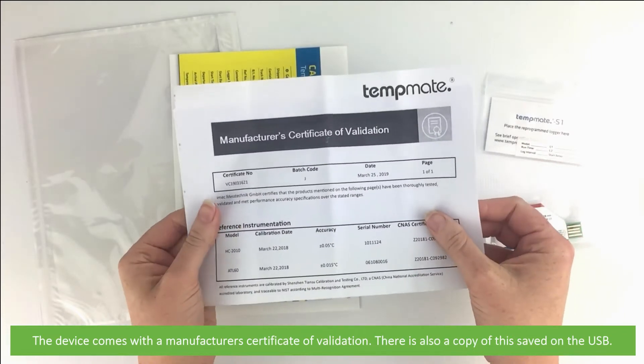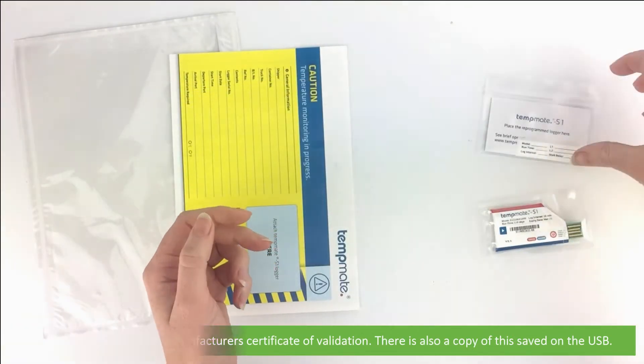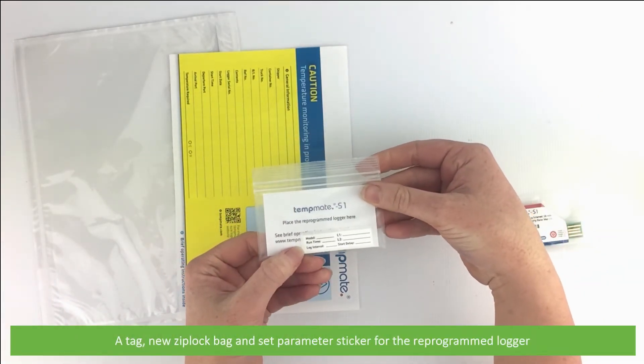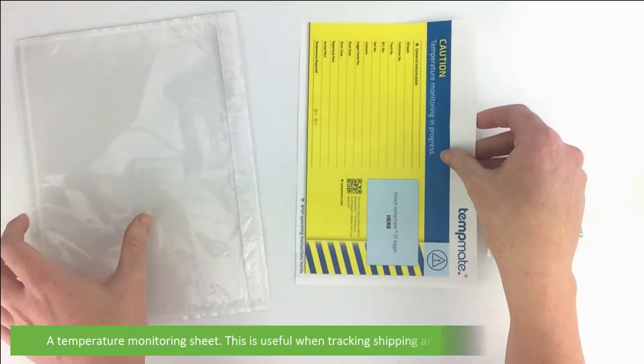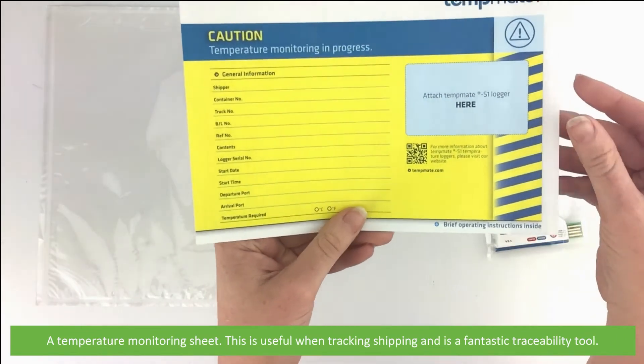The device comes with a manufacturer certificate of validation, and there is also a copy of this saved onto the USB. Also included is a tag, a new ziplock bag, and a set parameter sticker for the pre-programmed logger. There's a temperature monitoring sheet, which is useful when tracking shipping and is a fantastic traceability tool.